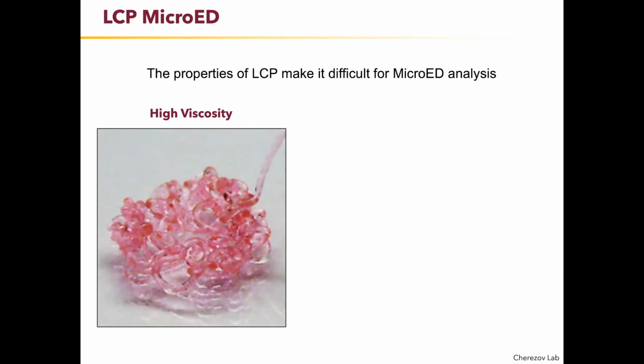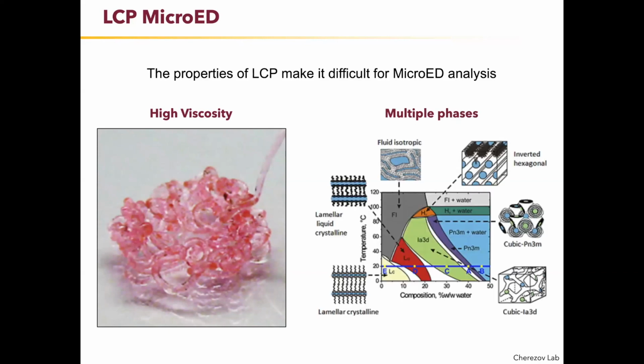So that's one problem. The other problem is you can't simply dilute it away, because LCP is one phase of this solution lipid phase diagram. And so if you start diluting, you don't necessarily just remove the LCP, but you can start to flip phases, which may be actually more viscous or may cause your crystals to crash out. So you have to really play with this phase diagram and make educated decisions about how you're going to work with the LCP so you don't make an even worse phase.